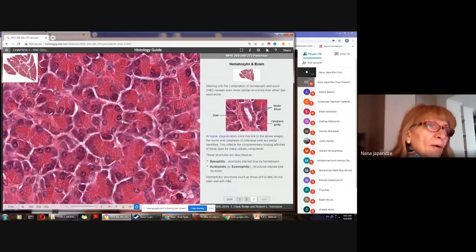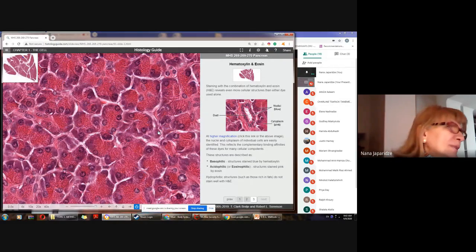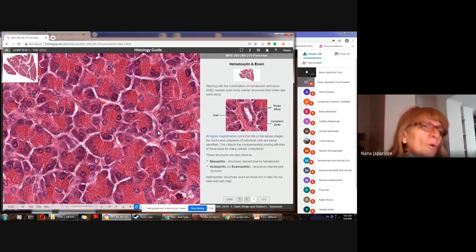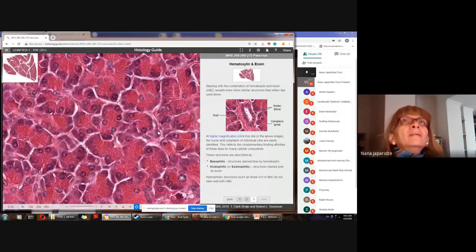Okay, hopefully with staining, I mean basic dye, acidic dye, basophilic staining, acidophilic staining, or co-staining, everything is clear. Let me summarize these topics.